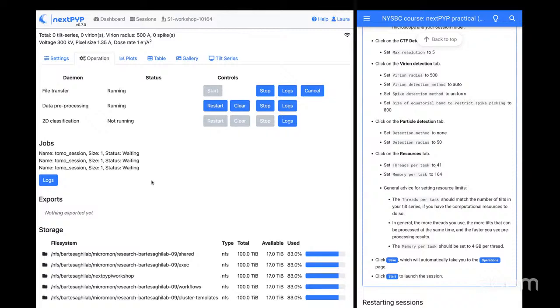Yes. While we're running, does it affect the data acquisition speed, if you're at the microscope taking the images? Because we're collecting the data, we're transferring while we're processing, right? Does that affect the speed of the data connection? Everything that's processing should be happening on your local machine, which is separate from the microscope. But it's using the storage system where the microscope stores the images, right? And it's storing on that same storage while it's also transferring to the other local machine.